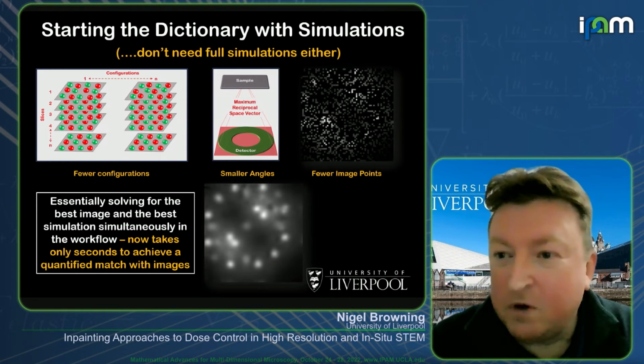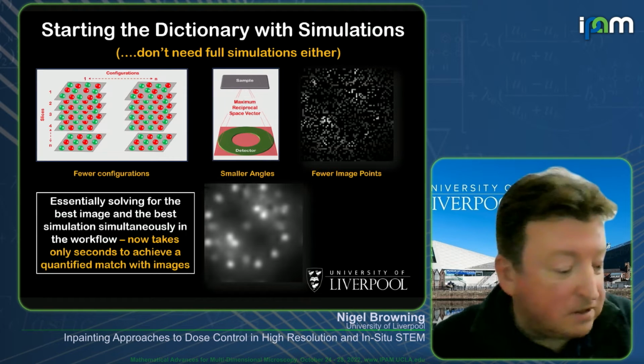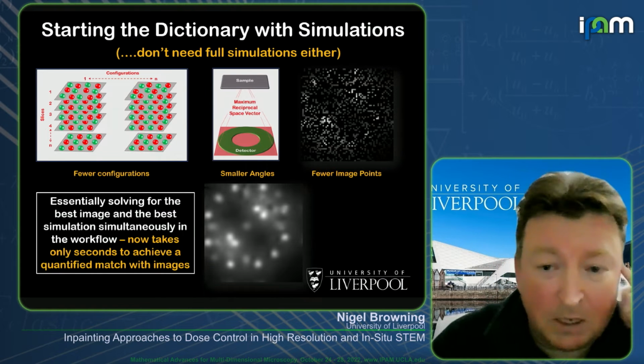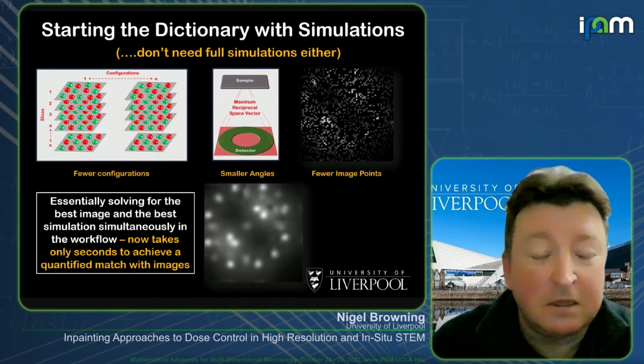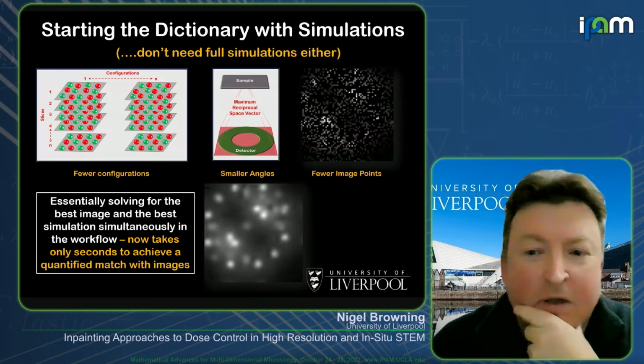So now, if we've got that, what that's doing is saying that if we've got something that has lower noise, we can get a better reconstruction. And we just submitted a paper on simulations where the poor students got absolutely hammered by the referees, and I think we're missing the point in terms of what we were trying to get out of the simulations.